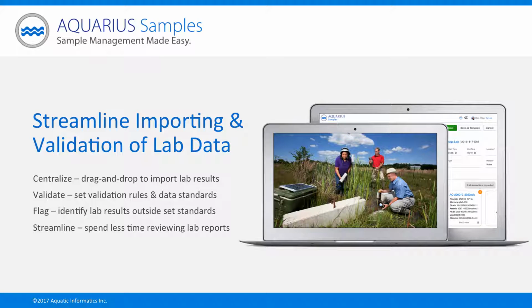In this video, we'll look at how to save time and reduce data entry errors by uploading results directly into AQUARIUS Samples, including all relevant metadata. We'll see how validation rules and standards can be applied to automatically highlight lab results that require your attention, saving time in the process while ensuring the highest quality data gets into your system. Let's take a look at importing data into AQUARIUS Samples.